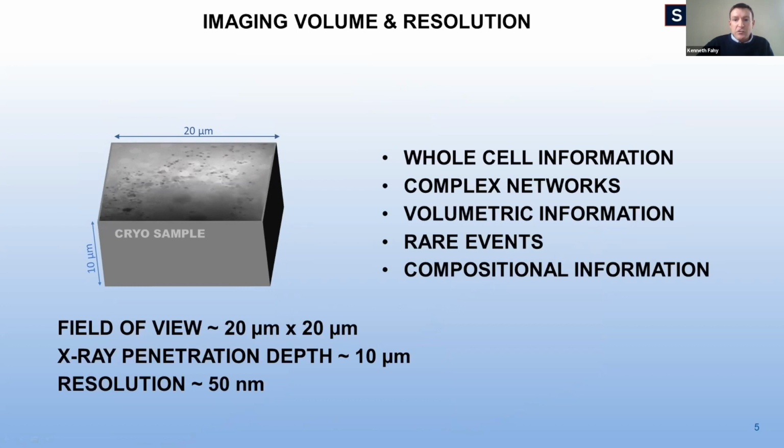So this allows us to address certain application questions that can benefit from soft X-ray tomography, and these are where whole cell information is needed, information on complex networks or volumetric information. Rare events can be nicely captured in the context of a whole cell, as well as compositional information.